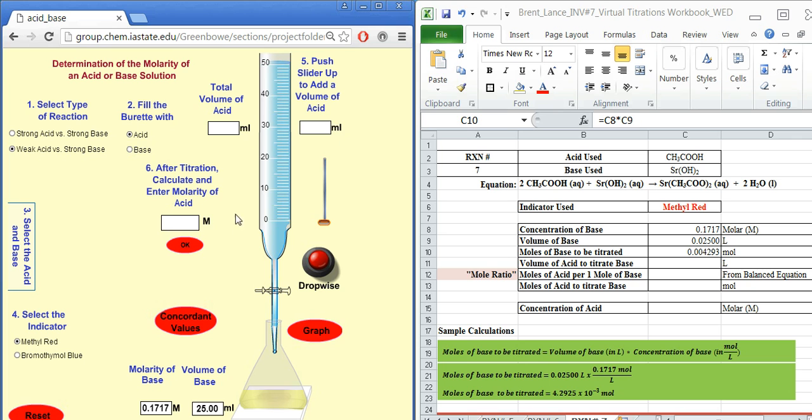So anyway, I did notice that when I put in a certain amount and it didn't change anything, then I could start going dropwise, and it might save you a little bit of time. I'll even pause my recording for a second, and I'll get close to the endpoint, and then I will continue with that.